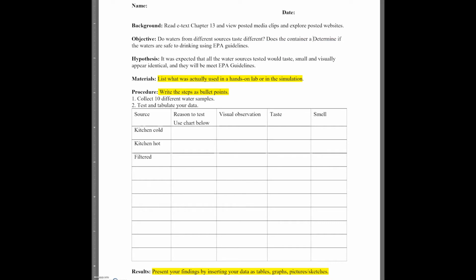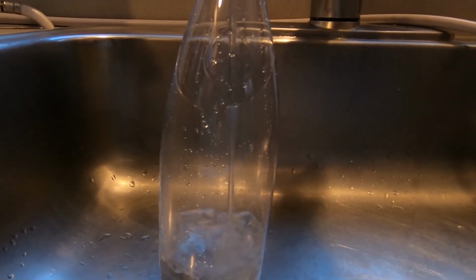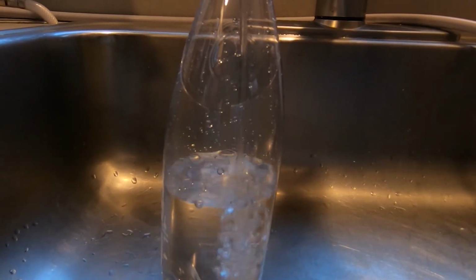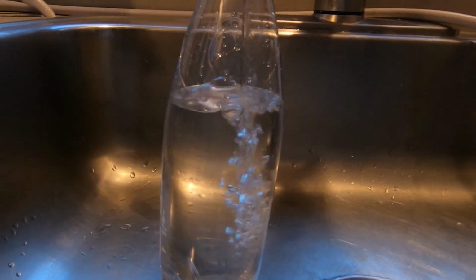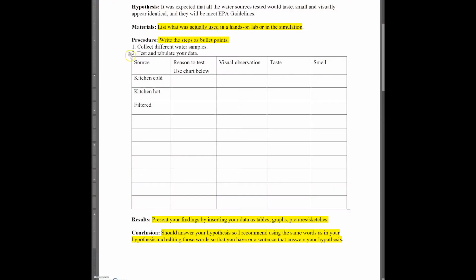So let's try to add some information about what our experiment is trying to demonstrate. The objective will be on what direction your experiment goes. So what types of water are you going to be testing? Bottled water? Regular tap water that was heated in a water heater? Any other safe drinking sources you know of? Do you have access to a water filter?